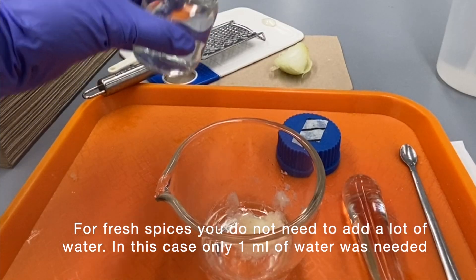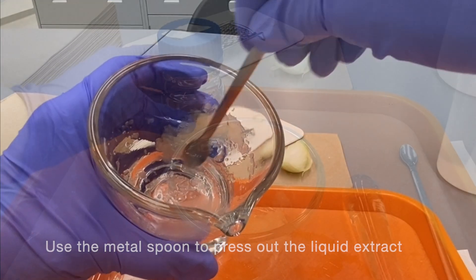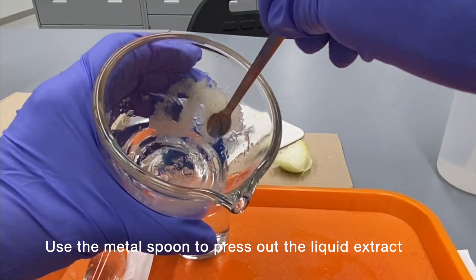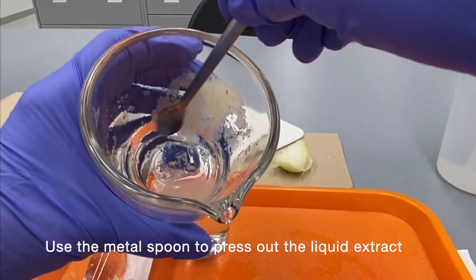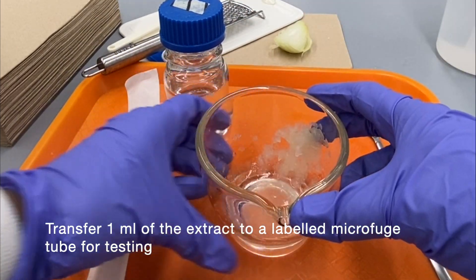For fresh spices, you do not need to add a lot of water. In this case, only 1 milliliter of water was enough. Use the metal spoon to press out the liquid extract. Transfer 1 milliliter of the extract into a labeled microfuge tube for testing.